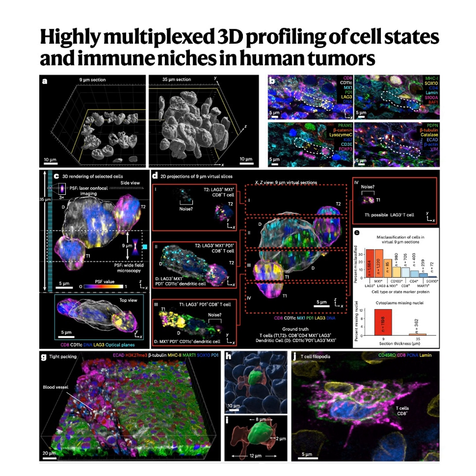This whole cell view also allowed them to capture fleeting, really dynamic events in action, didn't it? Like immune cells actually caught in the act of moving between tissues. Yes, they managed to capture snapshots, providing clear physical evidence of transendothelial migration, which is also called diapedesis. That's the process where immune cells squeeze out of blood vessels to enter surrounding tissues. What did that look like in 3D?